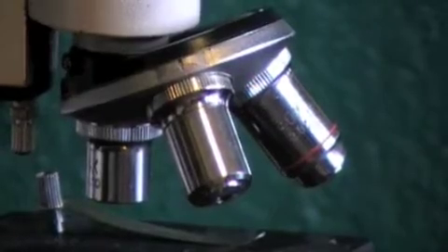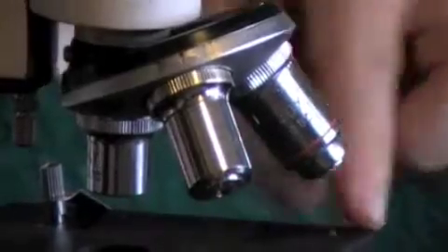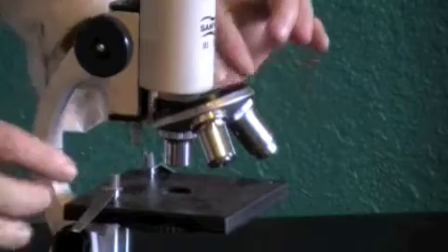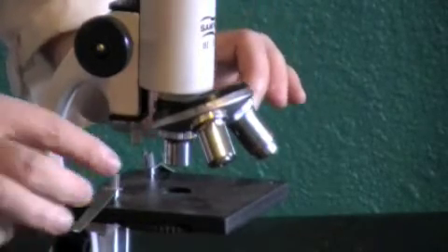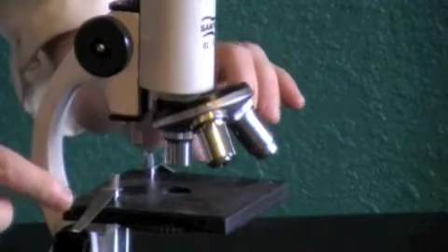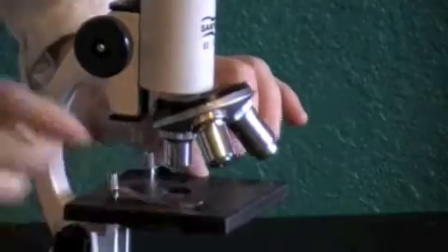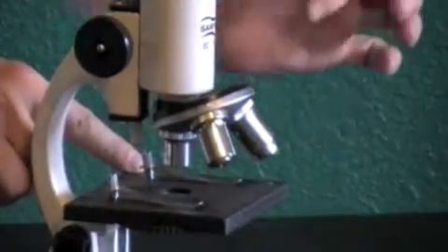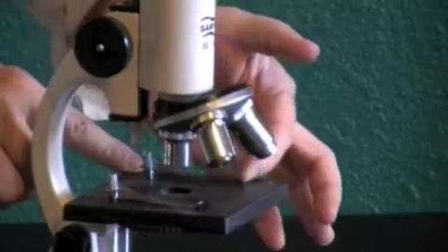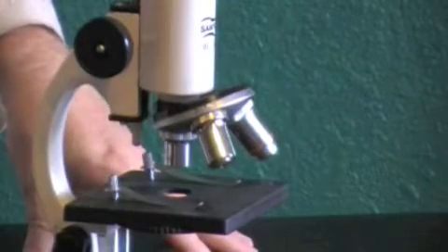Because when you put a slide on, what you're going to do is slide your stage clips. This is your stage, down at the bottom. Slide your stage clips to the side. Set your slide on here, with the hole in the middle of the stage being where you're going to want your main thing to focus. Take your clip, slide your clip back up on here. Do not pick it up and snap it. That will break your slide. Take it from the side, move it across very gently, and you'll have your slide on there.